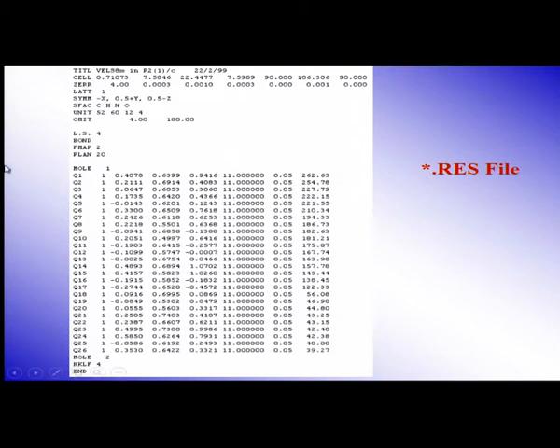Okay. Now, first thing, let us go one by one. The last column denotes the electron density of each atom. The program does not know which is carbon, which is nitrogen, which is oxygen, but it has assumed all the atoms to be of equal type, species 1 is carbon. So, that is called an equal atom structure, because without having some scattering factor value we cannot calculate the structure factor.